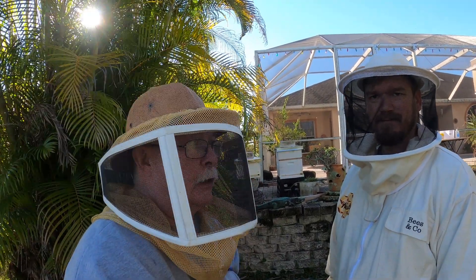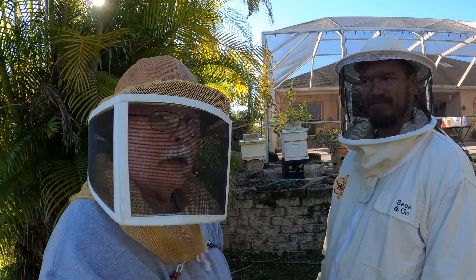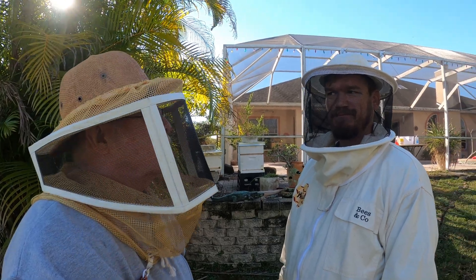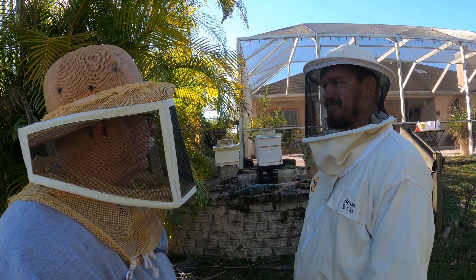Hello, this is Bruce, and today I'm with my friend Weston. What we're going to do today is an alcohol wash and a mite count to see how it's going. This will be a first time for Weston with his bees, so we're going to give it a shot.